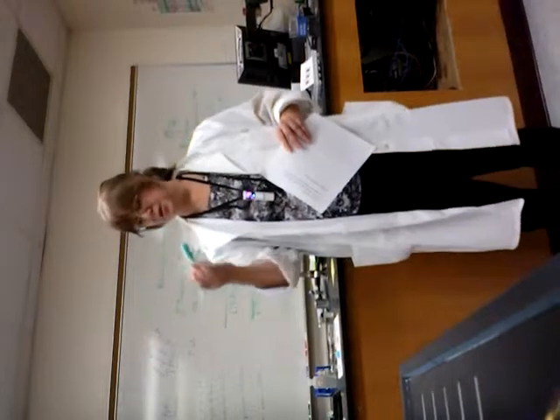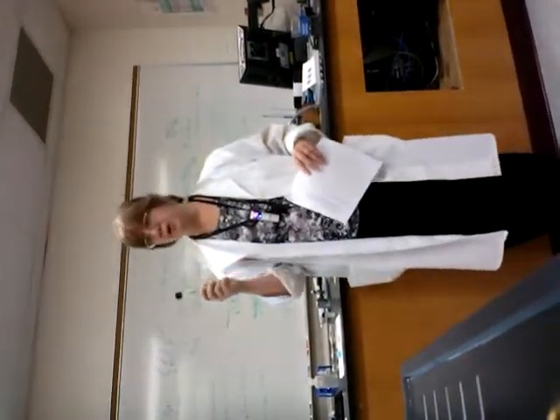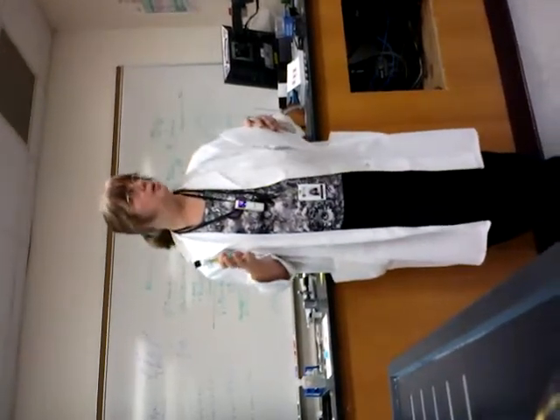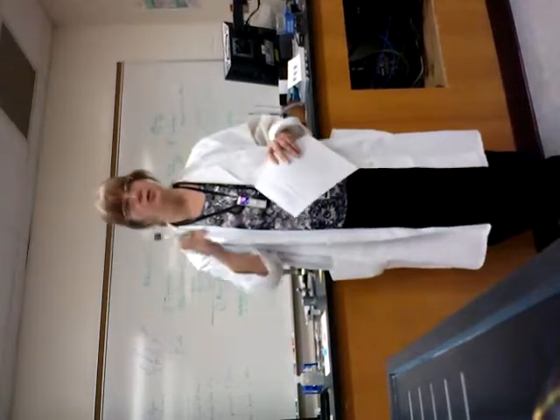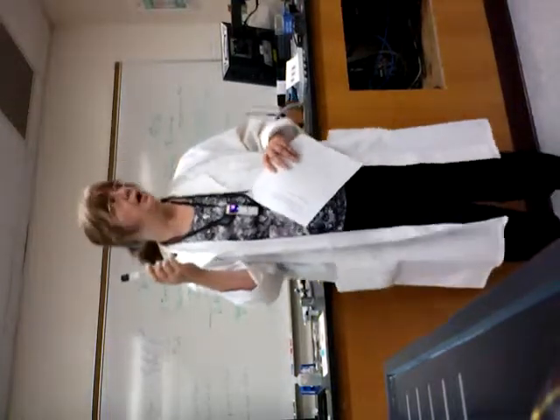When you took this one, I'm going to show you a picture in a minute. This nice black one. You did an acid-fast stain. That was always for mycobacterium. You did it in the hood. You used moist heat, boiling water, and you put what dye on filter paper to dye this organism? Carbolfuchsin. So these are hot heat.